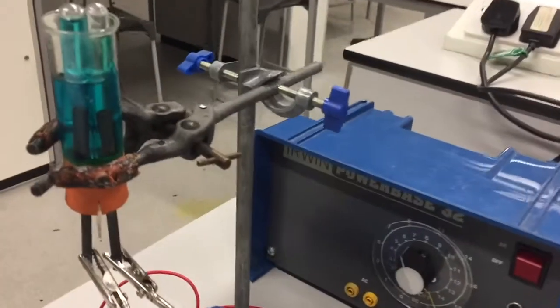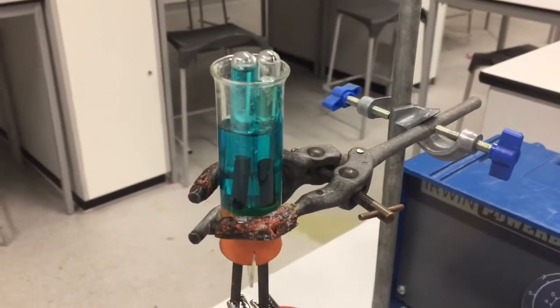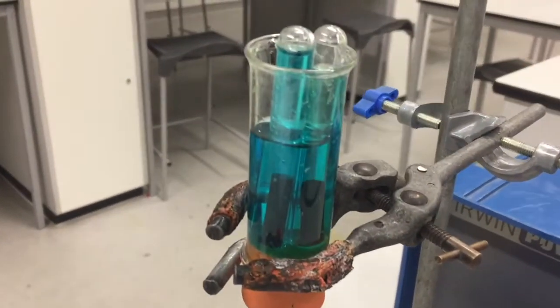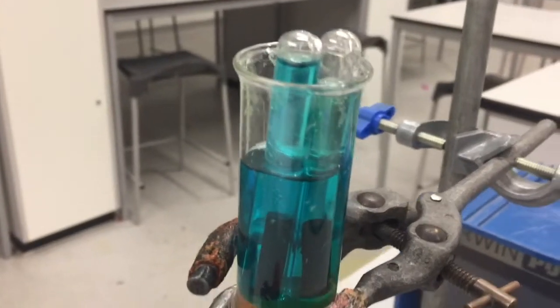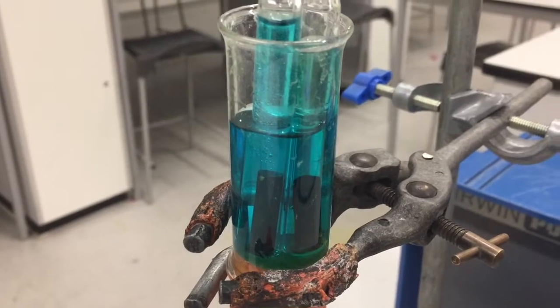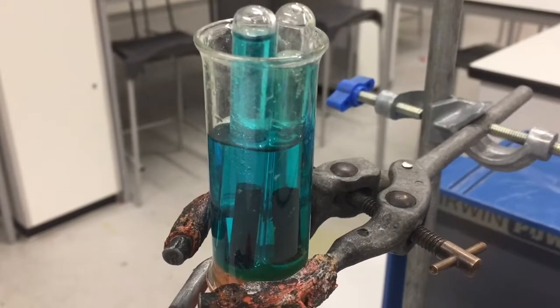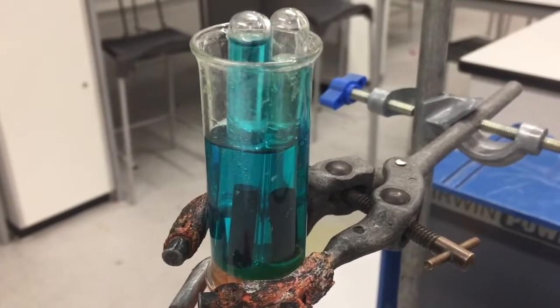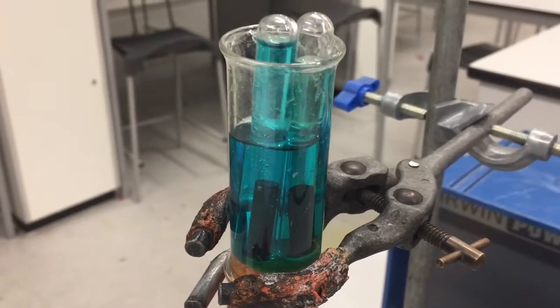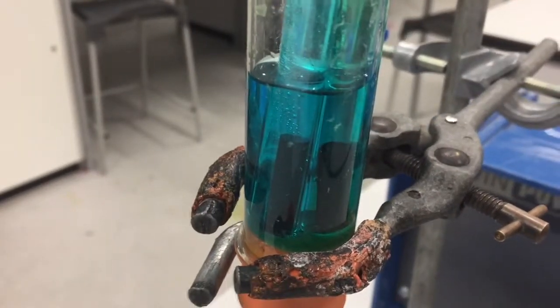And so if we switch on our power pack, as a warning for this practical, the first product which is going to be produced at the anode is going to be chlorine gas. Now, collecting the chlorine gas in an upside down tube does make it a little bit safer, and if you don't collect it in an upside down tube, it is safe in a lab. You don't have to do it in a fume cupboard. That's absolutely fine. So you should be able to see that there are bubbles being produced there.